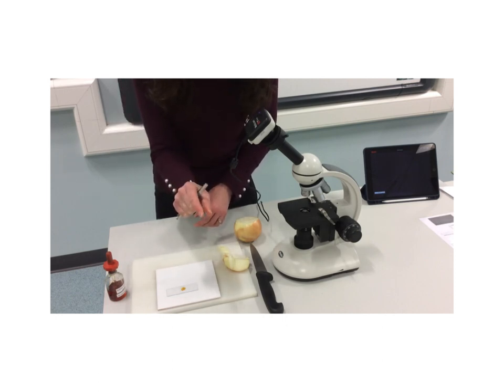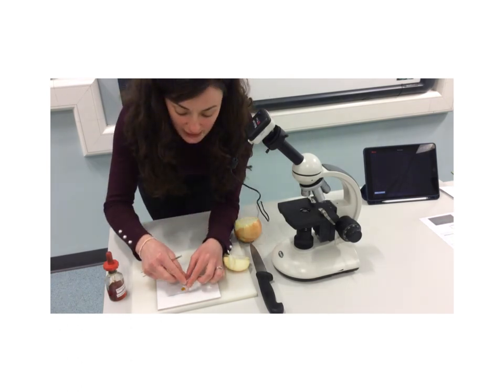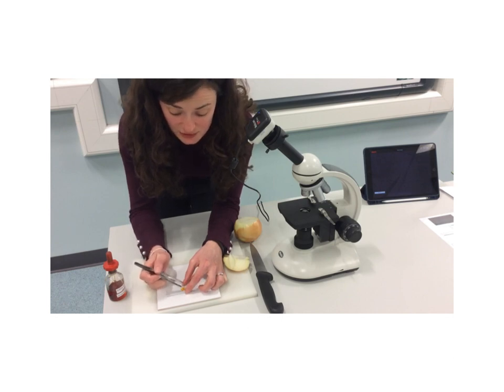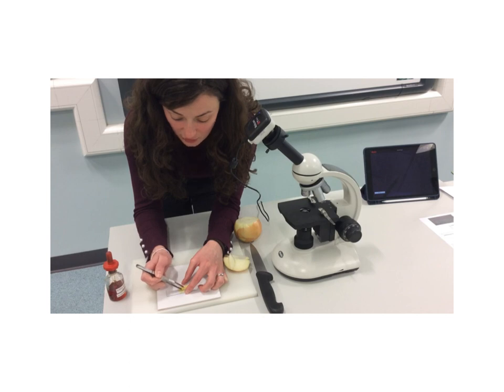It might be hard for you to see in the video, but it's just a very, very thin piece of glass. What I do is I hold it at a bit of an angle and then lower it down, and I can just use my tweezers to do this. Sometimes use something called a mounting needle, and we want to lower it down very gently, to try and minimize the risk of air bubbles.